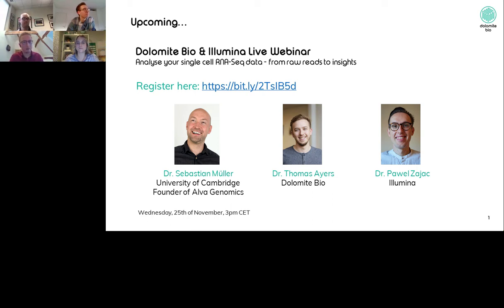Yeah, absolutely. I'd love to add something on the hardware side there. Of course, experimental design does come first, and I think Adam's done a great job of talking about all that kind of thing. But in terms of absolute cell numbers per sample that can go onto the Nadia machine, which is what I can talk about, our standard single-cell RNA-seq protocol suggests a starting number of cells per sample of 75,000. However, due to the fact that the Nadia is a very versatile machine, we can not only change all of those parameters that I was talking about previously, we can also bring the amount of input from that standard amount of 250 microliters down to around 100 microliters, which means at the same cell concentration, we can go from 75,000 down to around 30,000 cells. So that's what I'd say per sample is the recommended minimum cell input on the Nadia platform.